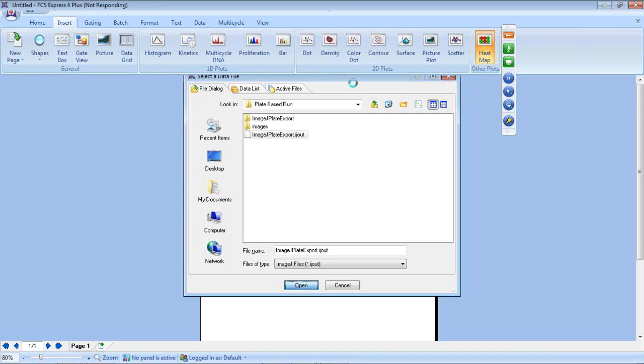We're also loading up all of the mask or background images for that. And then we're loading in the cell-by-cell or multi-parametric results for all of these different channels in this assay. That way we can view, again, all of this within a heat map. We can start using that heat map to find interesting populations or interesting hits in our experiment if we're doing a sort of hit-based experiment.